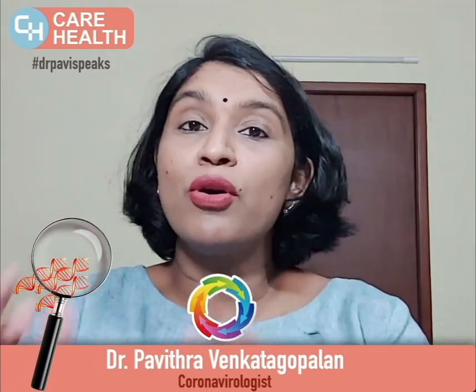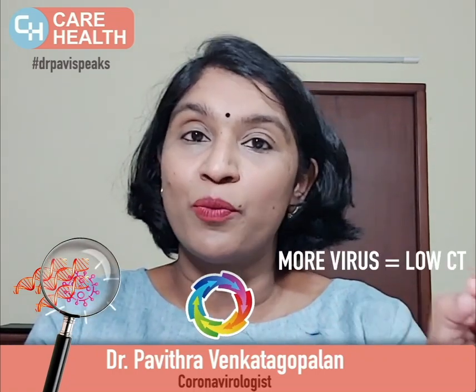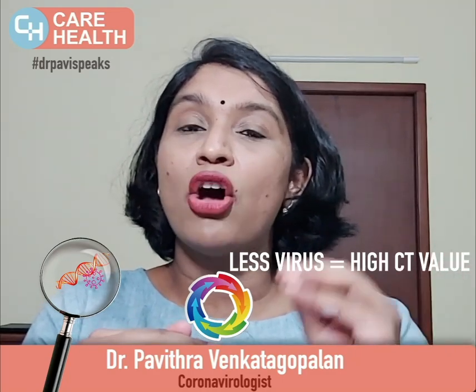What it means is, if there is more DNA or RNA of your specific region to begin with, in this case if you're looking for COVID DNA or RNA and there is more of it in the sample, the test will be able to see it much faster, which means the threshold cycle, the CT value, will be low. Whereas if there is a smaller amount of COVID specific DNA or RNA in the sample, the amplification has to take place a lot longer before it can be seen by the test. At this point the CT value will be high, which means the person has a lot less viral DNA or RNA in that sample to begin with.